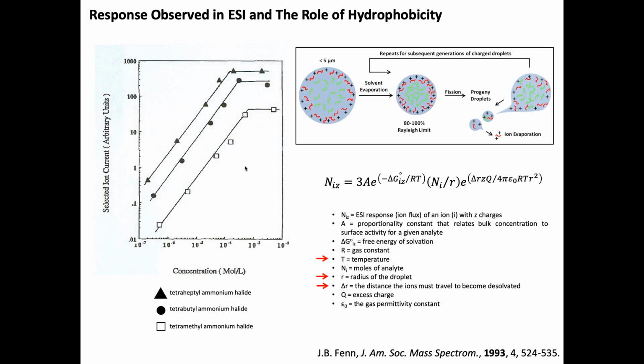So all those things can play a role, as well as the chemical interactions, not just hydrophobic, but also ion interactions, that kind of thing.